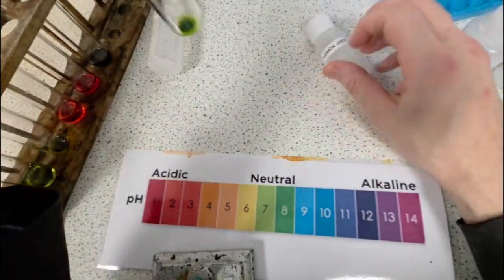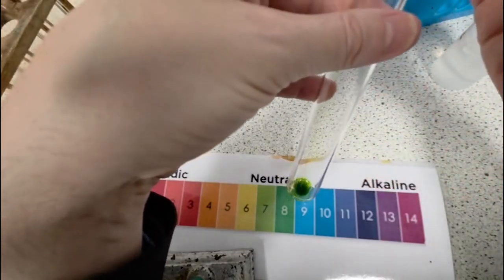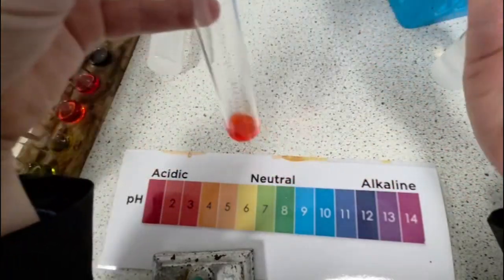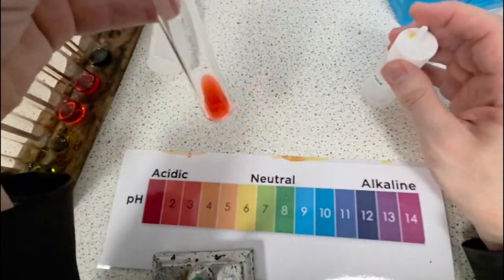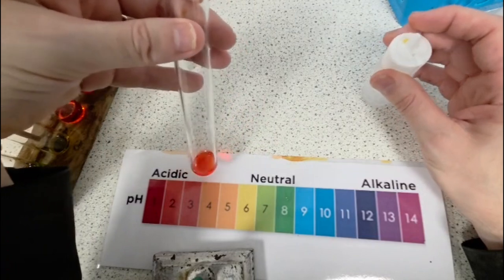And finally, we'll move on to lemon juice. Once again, pour a small amount into the tube and we'll see what happens. And as you can see, the lemon juice is quite a light shade of red. That's probably around a 3 or a 4.